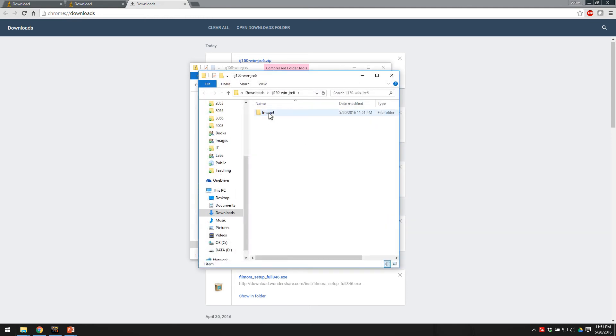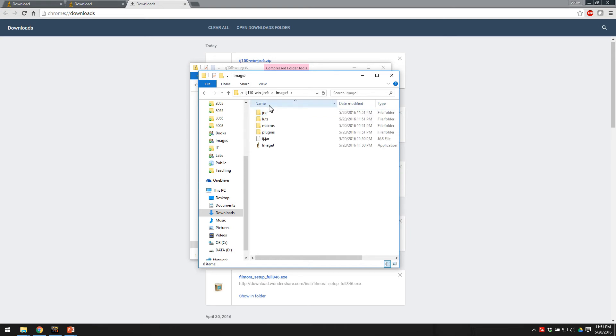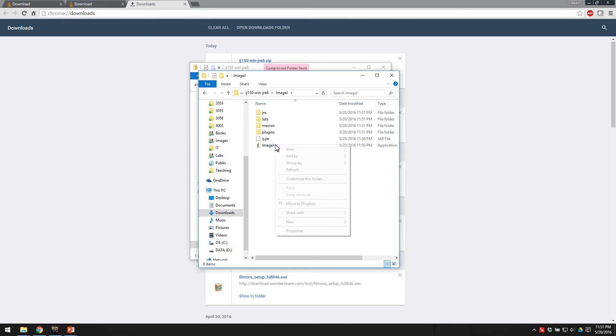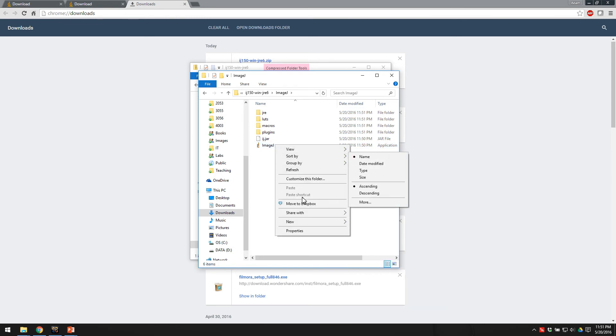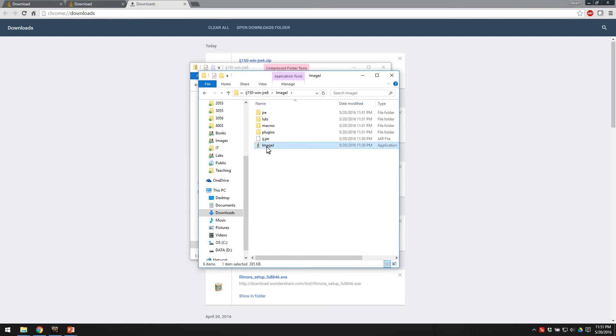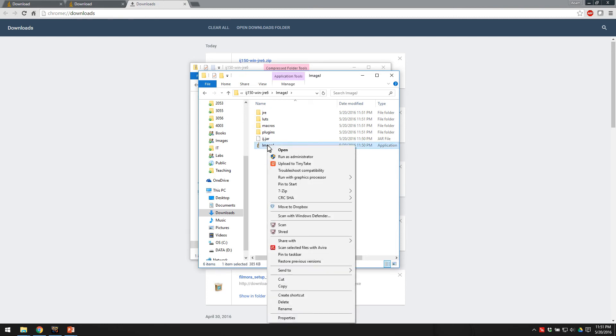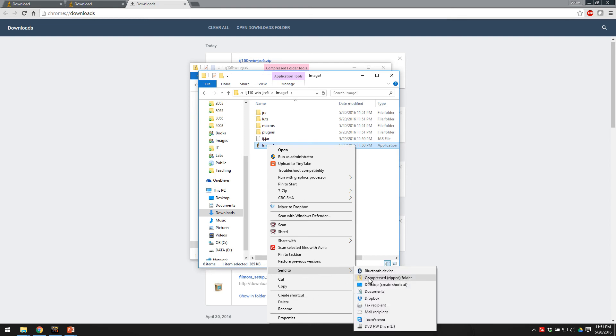Once the file is done extracting, you can just double click it, and if you'd like you can just maybe save a shortcut to your desktop. Send to desktop, create a shortcut. So you just click that.